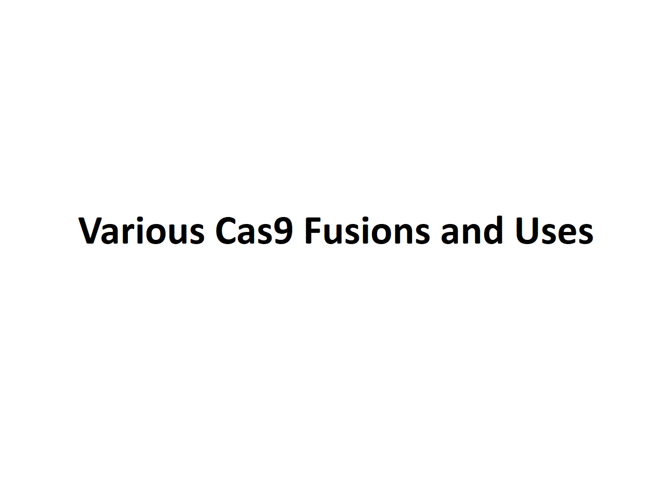And so on that note, I'm going to transition into some of the other uses of the Cas9 protein that some of you may not be aware of, but may be very useful for your research. A lot of this is based on using the dead Cas9, so the nuclease-free Cas9, essentially using it as an ability to bind any sequence in the genome and then bring other molecules there to do specific functions.